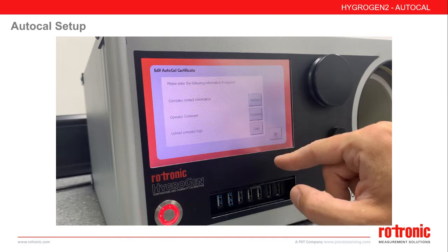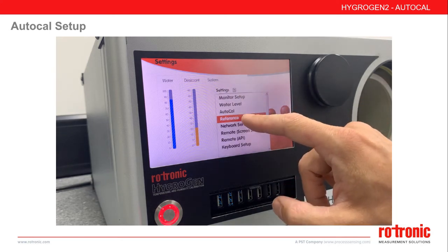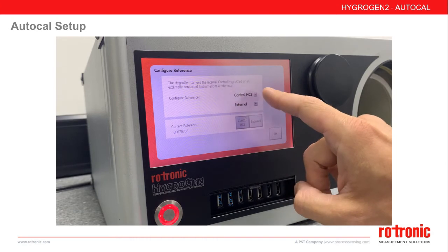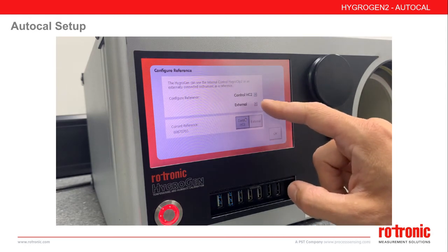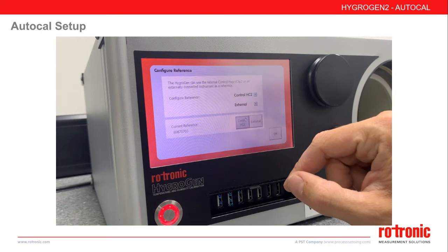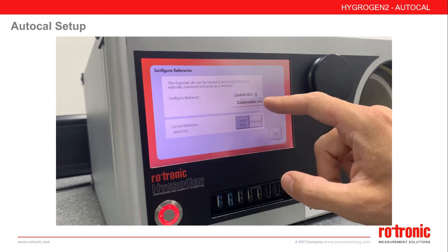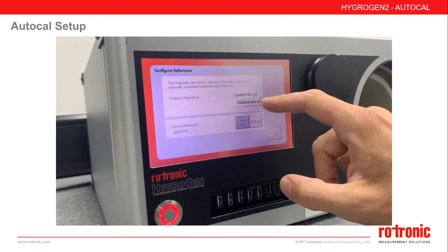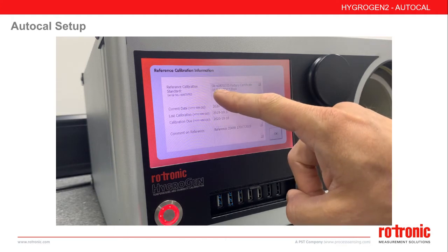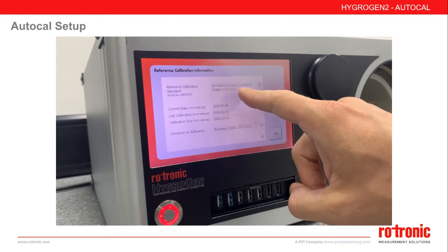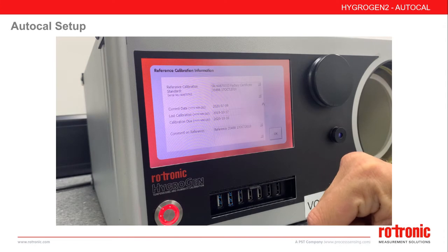Once we are set up, we can return to the main settings screen and configure our reference by selecting Reference. Here we have two options: we can use the internal control probe within the Hygogen, or if available, you can use an external chilled mirror — though you will also have to purchase the external reference extension code. For the control probe, we can select the calibration information, which gives you an opportunity to enter important reference details for your certificate, such as the factory certificate ID, UCAS certificate ID, and the dates of calibration.